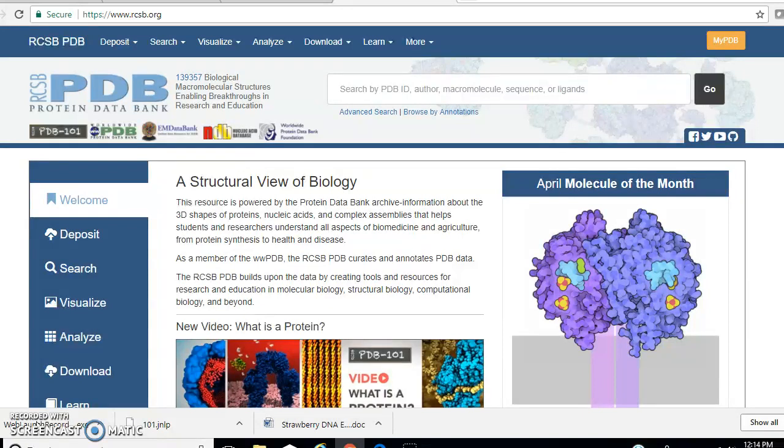So, this website is the Protein Data Bank. Why would I make a screencast of the Protein Data Bank? Well, because I'm going to ask you to go here today and look at proteins. I'm going to ask you to visit various parts of this website, get some really cool visualizations for proteins, and learn a little bit about what they do so that you can share it with each other and get a better sense of what proteins are, what they look like, what are some of the things they do, and what are some of the really awesome things that they can do.